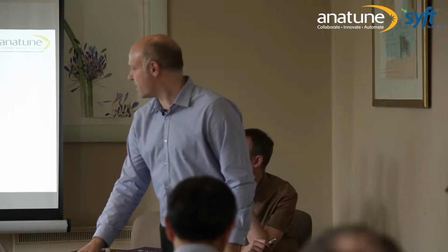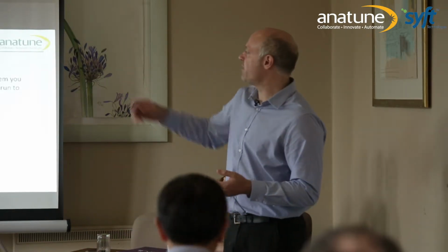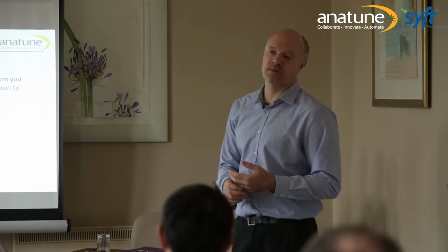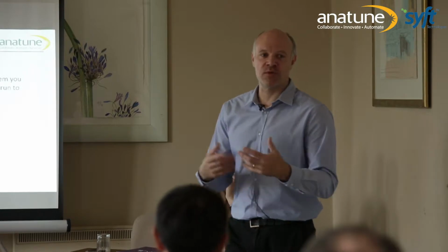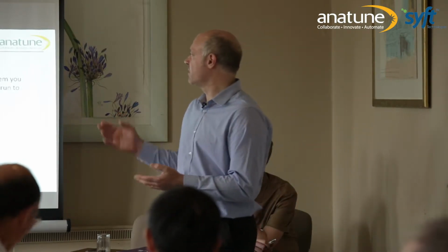The other thing to say, of course, about method development is it's much quicker on the SIFT-MS, because if you make a mistake in your method development, you've got your sample in the column at this point. It's going to take you maybe 20 minutes to run it back out the back end of the column before you can put the next one in. And so your method development process is somewhat slower with GC-MS.